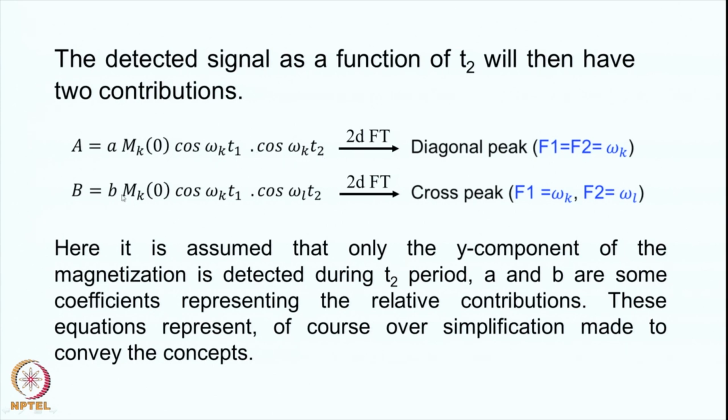So this, and the one which has gone on to the L, that will evolve with the frequency omega L during the period T2, right. So therefore in the T1 period this was cosine omega k T1, that was the component which had come as a result of evolution during the T1 period, and at the end of the T1 period this was partly transferred to B and some of it remained on A itself. So therefore this portion is at the end of the T1 period, and this is the result of evolution during the T2 period.